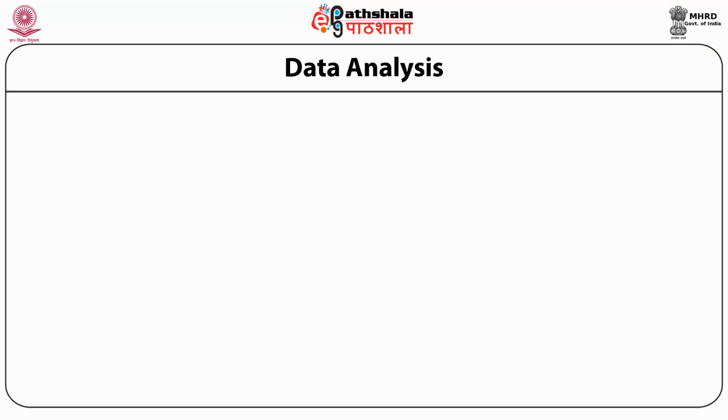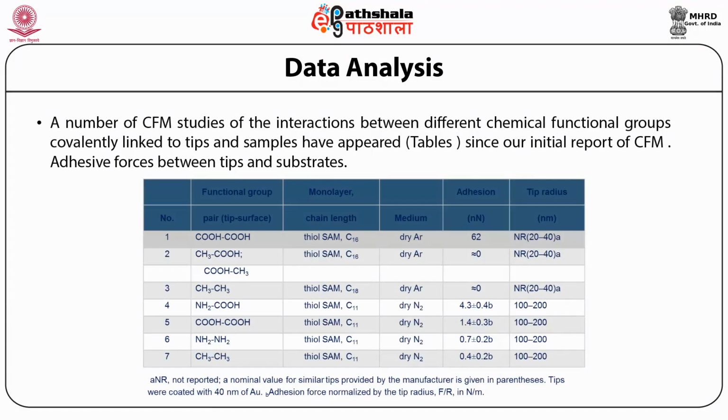We have been talking about chemical force microscopy. This can be very conveniently used to analyze the data, and this data analysis has been given here. A number of CFM studies of the interactions between different chemical functional groups covalently linked to tips and samples appear in the table given below.